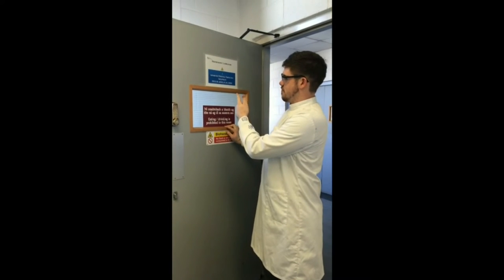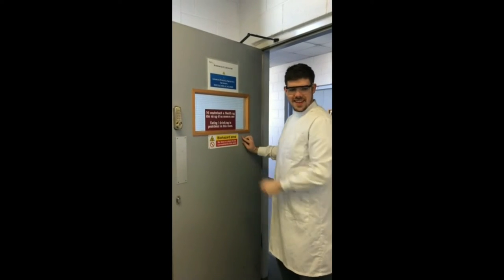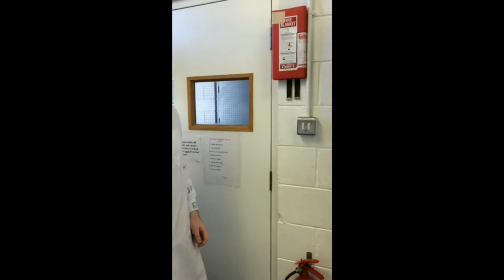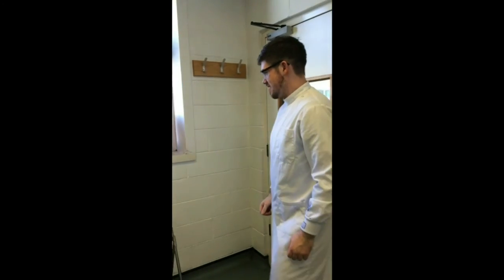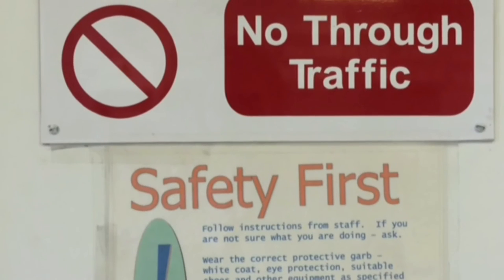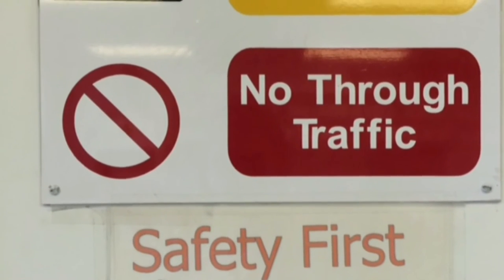Upon entering the lab, take note of all safety signs. Take note of the location of the first aid kit and fire safety equipment.